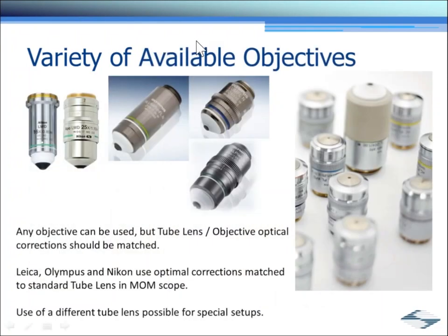All right. Of course, there's also a variety of available objectives in the world, you could say. And indeed, the Sutter MOM microscope can incorporate any of those objectives. What's important to remember is that the objectives used in the microscope should be fully color corrected for optimal performance.